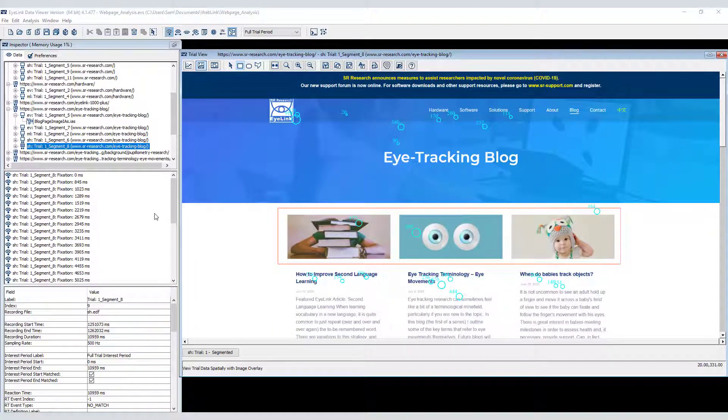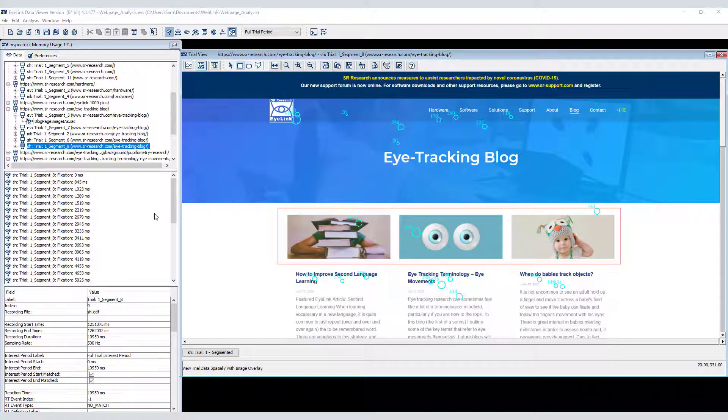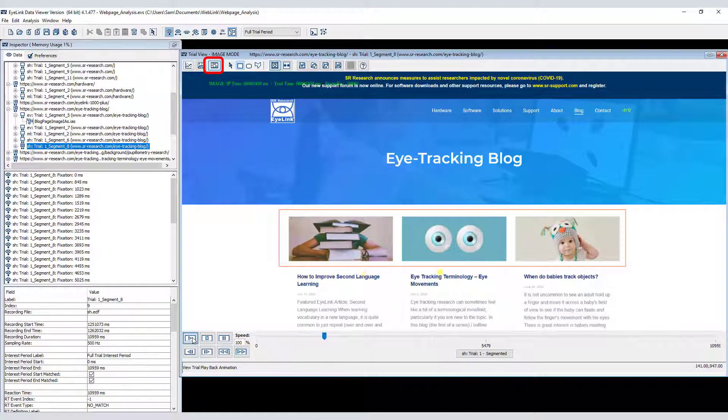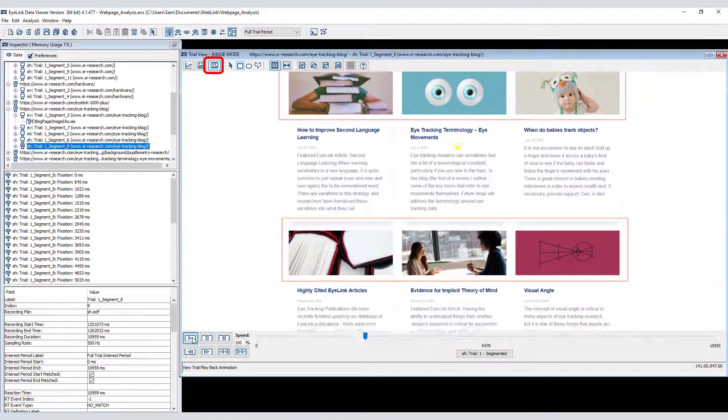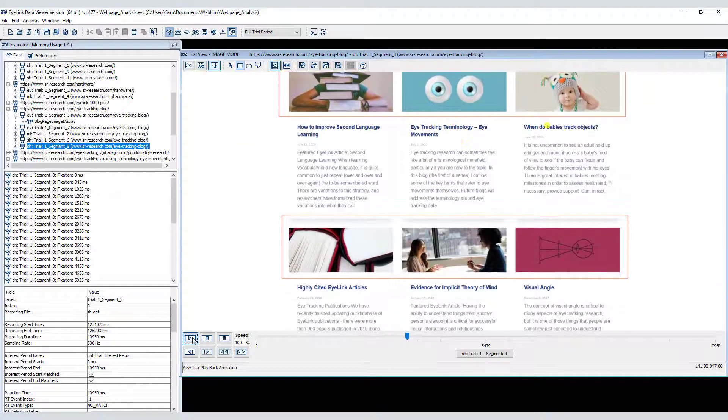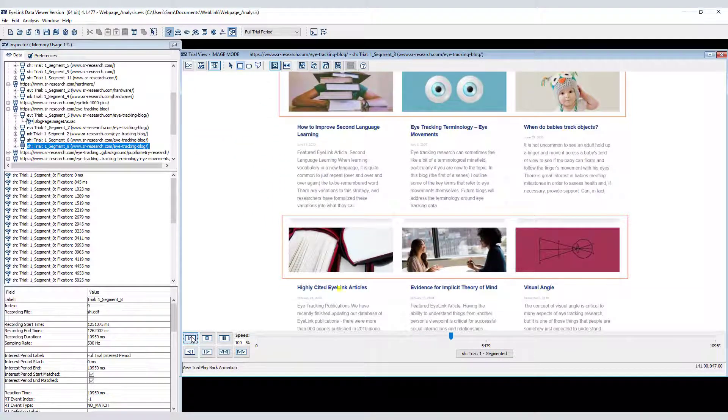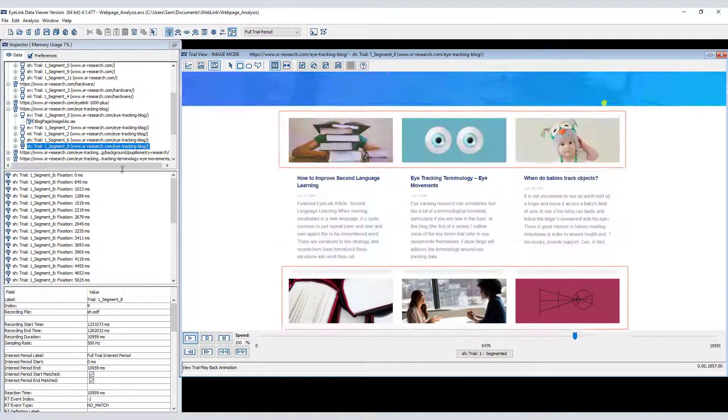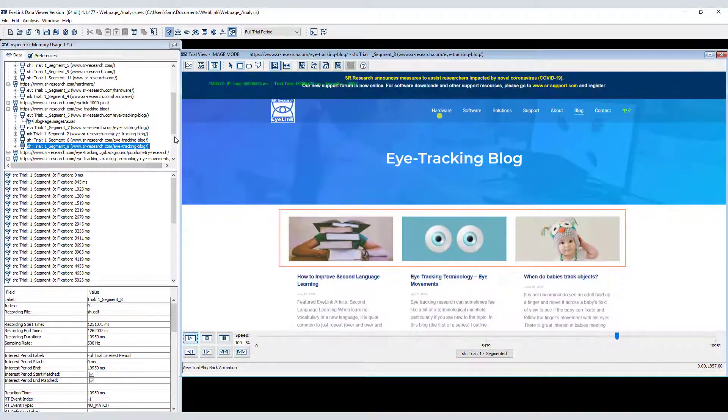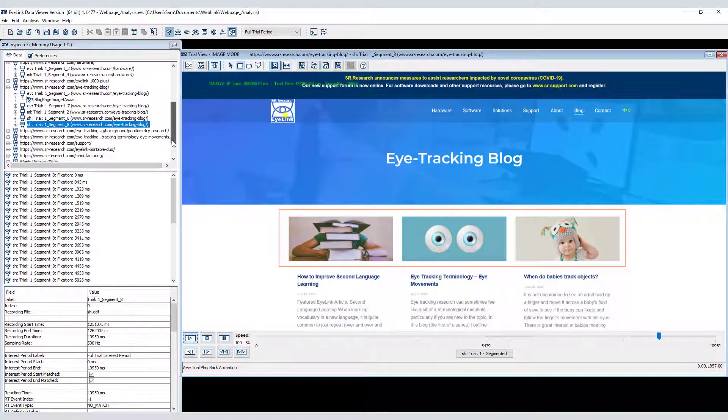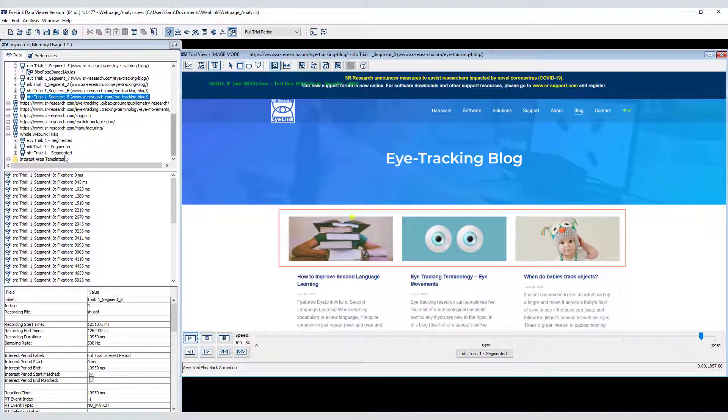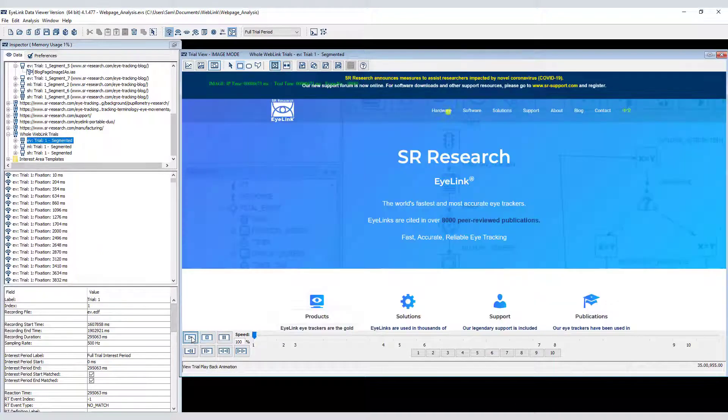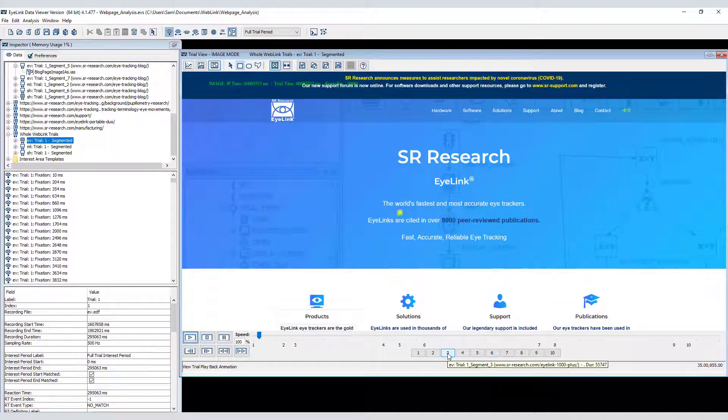In addition to the spatial overlay view, data viewer allows recordings to be played back with the playback animation view. Note that in this view the scroll compensation applies to the interest areas. You can play back individual segments like this one, or play back whole recordings. If you play back the whole recording, the segments are indicated on the timeline, and you can use the buttons to jump to any individual segment.